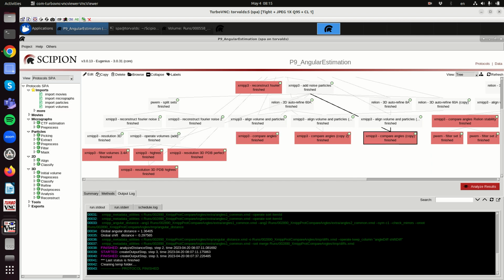So in this particular case, it didn't depend on how much you had filtered your initial map. Depending on the data set it may depend, but it may also not. It depends on the landscape of the goal function that we are optimizing, and how we are traveling in that goal function.